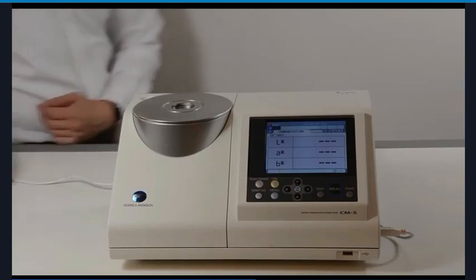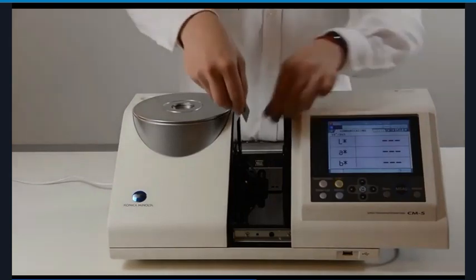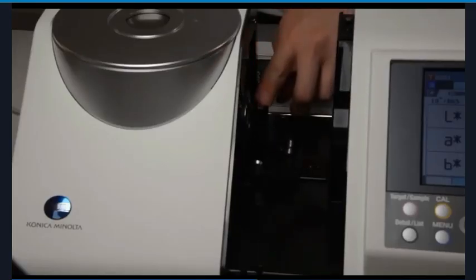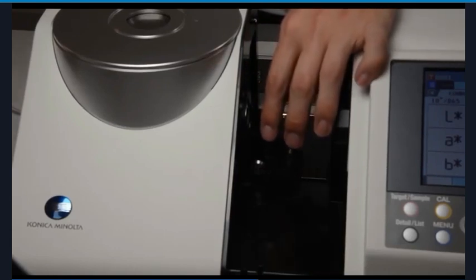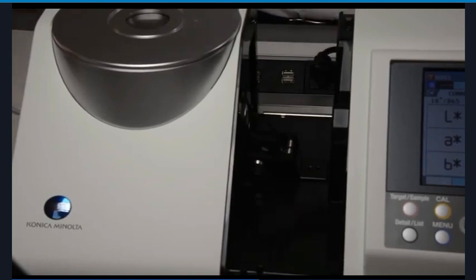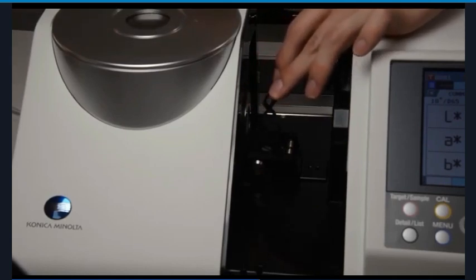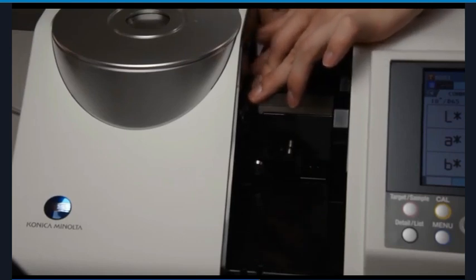We begin by opening the transmission chamber, and we will place the zero calibration plate over the exit port of the integrating sphere. When using the optional transmission sample holder, make certain the two arms are down unless you are measuring with a cuvette. Then we can retract the spring arm and place the zero calibration plate over the port.